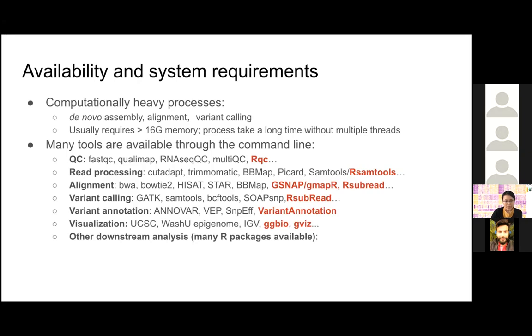So in a way, using R, you are able to process from the beginning to the end through most of these NGS data analysis steps. However, for a lot of particular processes, the options available in R may or may not be the best or the most commonly used approach. For example, for alignment, if you have short reads, the most frequently used aligners are BWA or Bowtie.